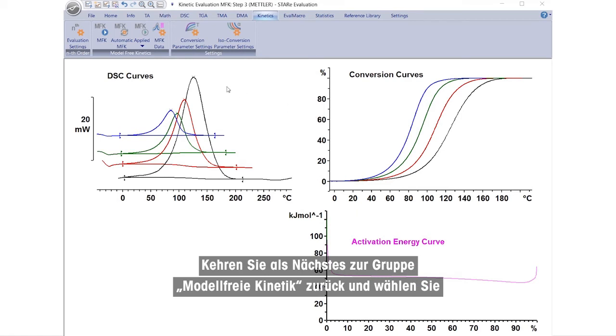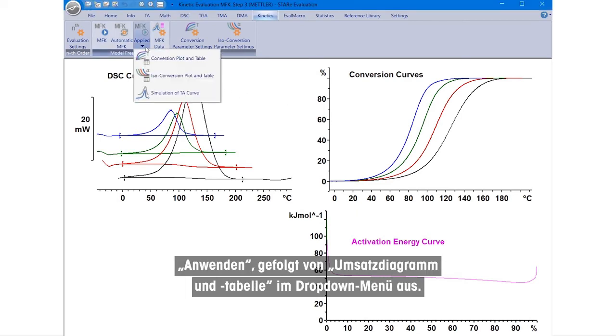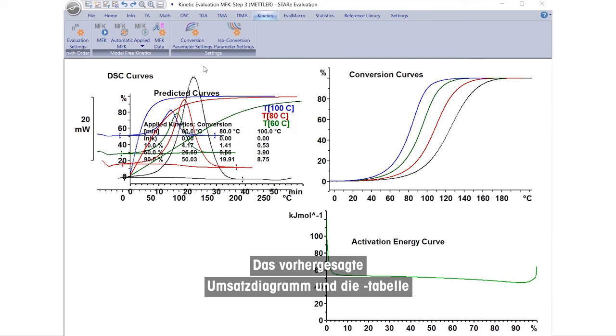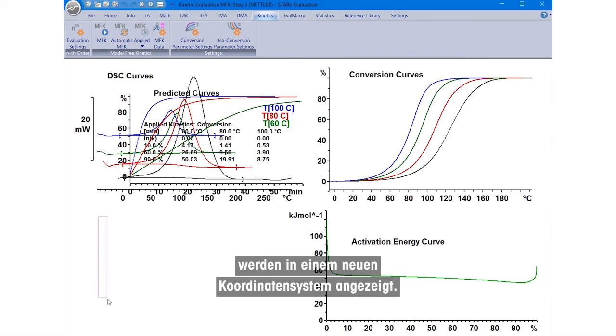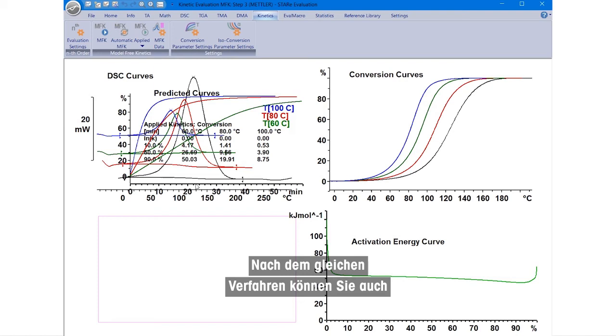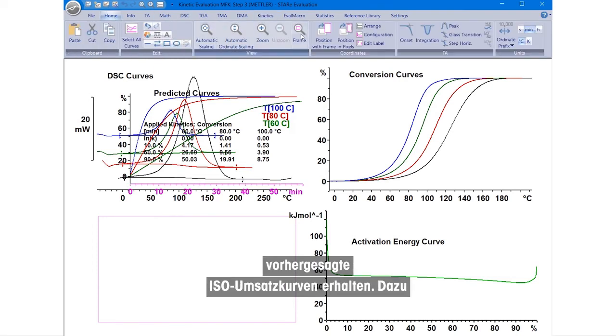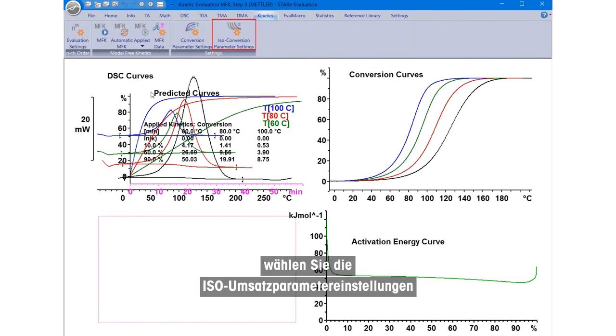Next, return to the Model Free Kinetics group and select Applied, followed by Conversion Plot and Table from the drop-down menu. The predicted conversion plot and table is displayed in a new coordinate system. Following the same procedure, you can also obtain predicted ISO conversion curves by selecting ISO Conversion Parameter Settings and entering the desired times.